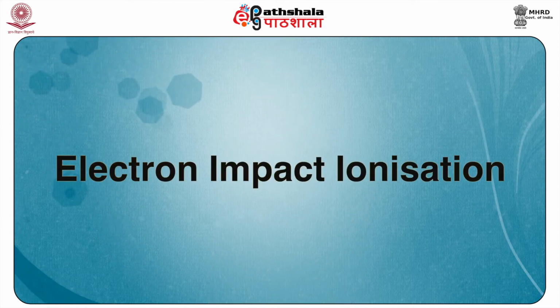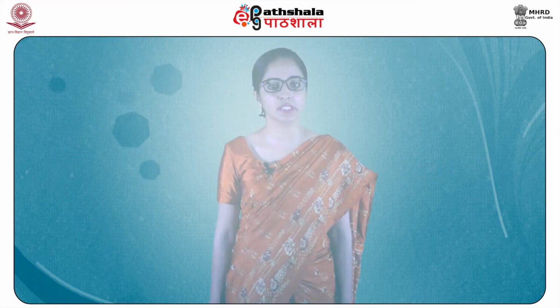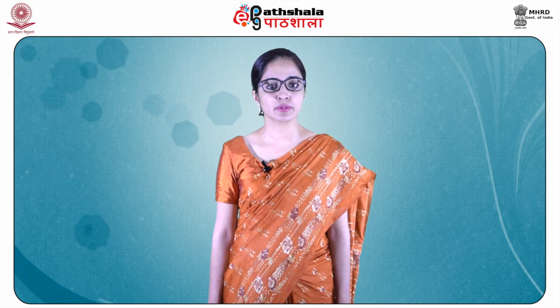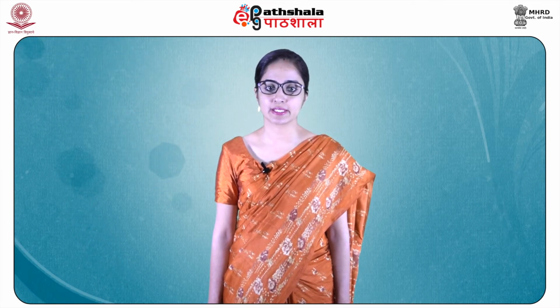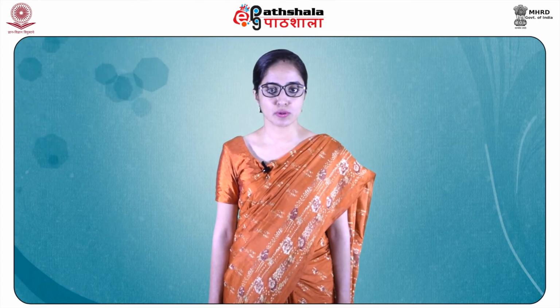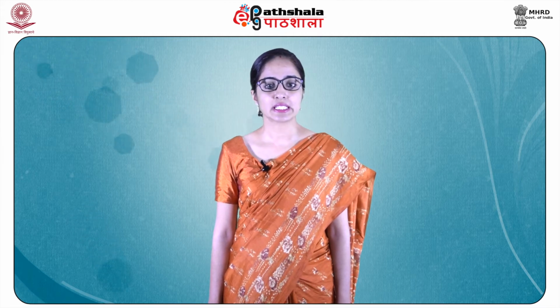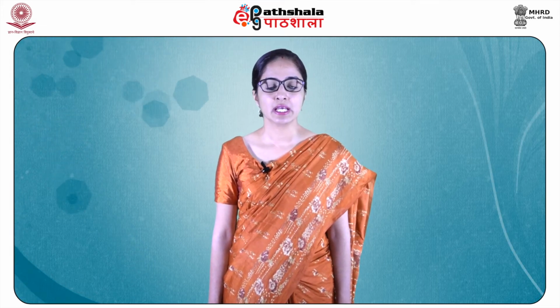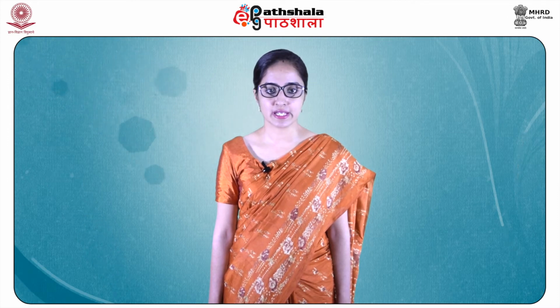Now students, let us take a look at the first method of ionization, electron impact ionization. This is the simplest and the most common method for converting the sample into ions. In EIMS, I will use this as a short form for electron impact ionization mass spectrometry, a beam of high energy electrons is emitted from a filament that is heated to several thousand degrees Celsius. These high energy electrons strike the stream of molecules that has been admitted into the sample inlet system.